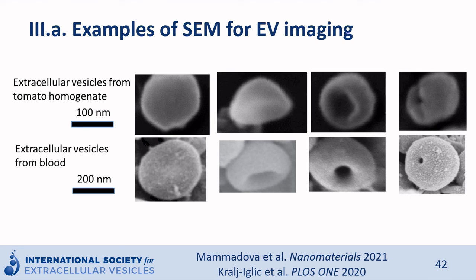The same shapes of vesicles were found in isolates from different sources, and these shapes also agree with theoretically calculated shapes of minimal membrane energy. The invaginations are not artifacts of preparation, but the intrinsic equilibrium shapes of vesicles subjected to different properties of the membrane and of the surrounding solution.